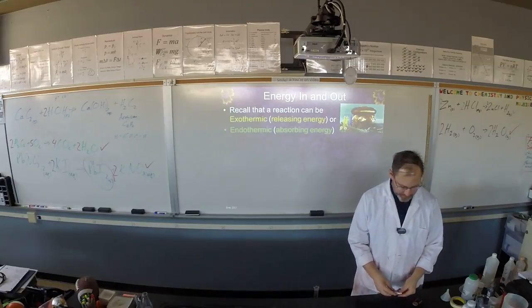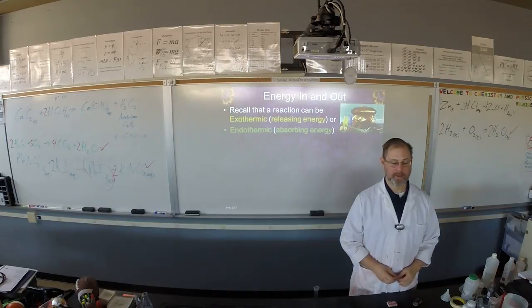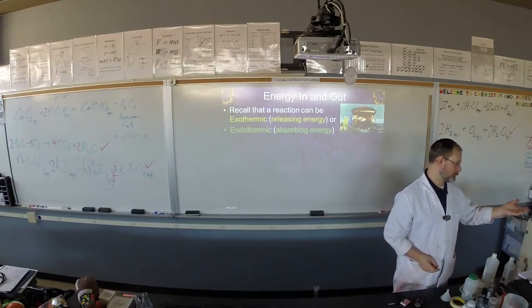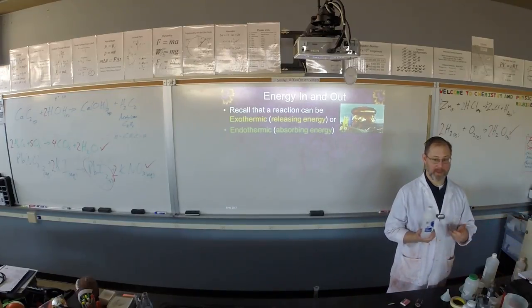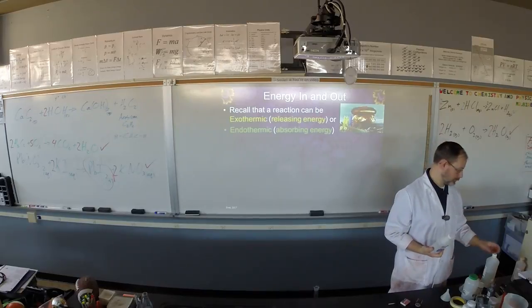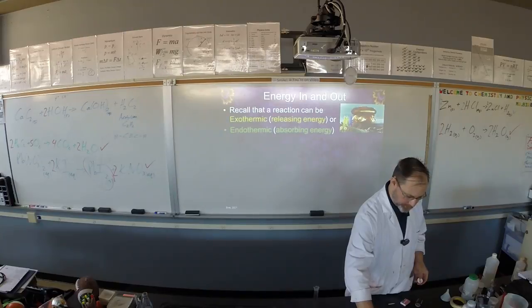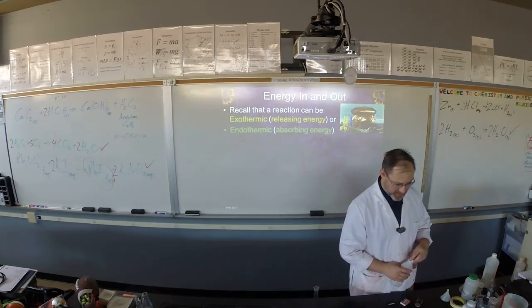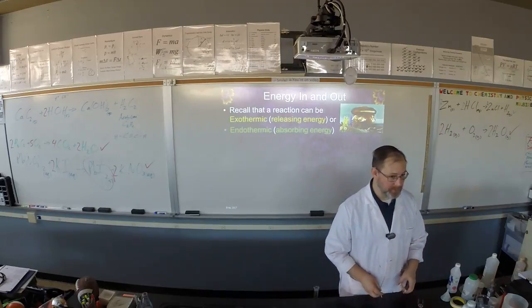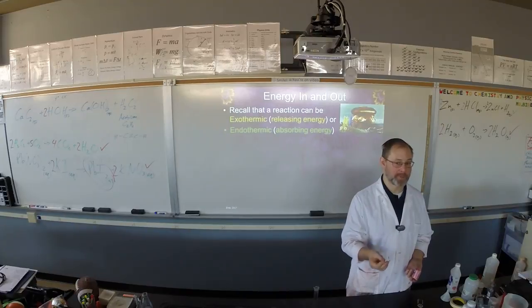So here's the thing about exothermic processes. I've got a lot of stuff up here that will react exothermically. I've got some matches. I've got some methanol. I've got some ethanol. I have some isopropanol, 70% isopropanol. I have gallons of this stuff. What better way to get rid of it than to light it on fire, right? So my little pool of isopropanol is right there, and isopropanol reacting with oxygen is an exothermic process, just like striking a match is an exothermic process.